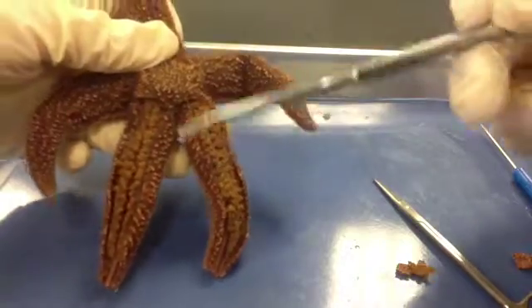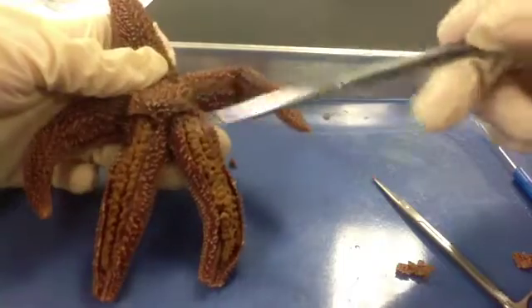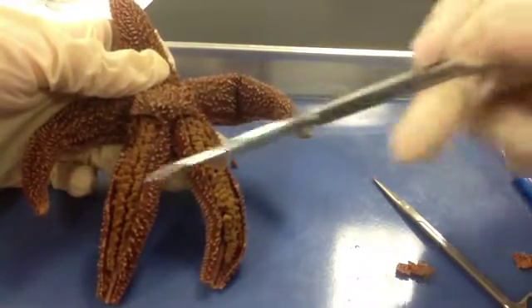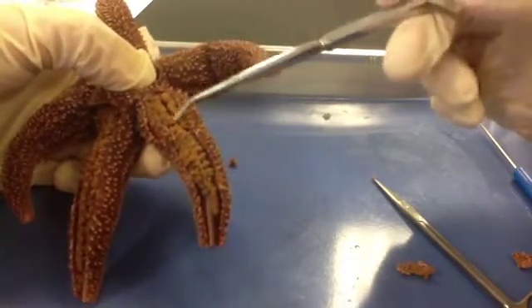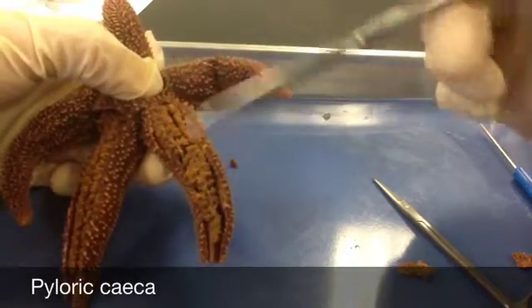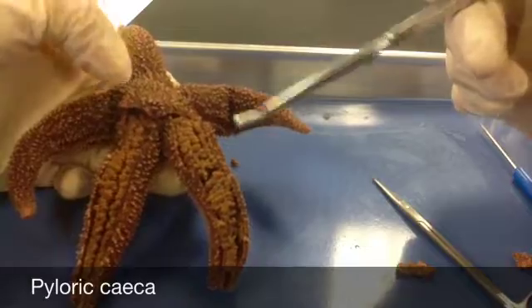If you've cut away more than one surface of the arms, you can see that they have identical structures in each arm or ray — identical organs. The first thing you're going to see are two long digestive glands called the pyloric ceca. These make enzymes to help digest food in the stomach. You can label these on your diagram.